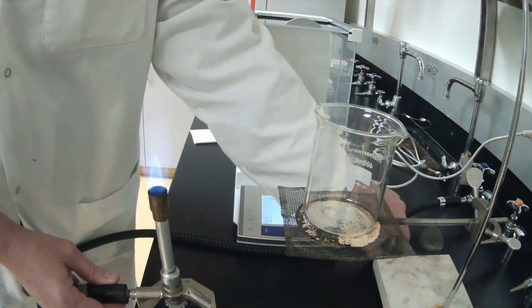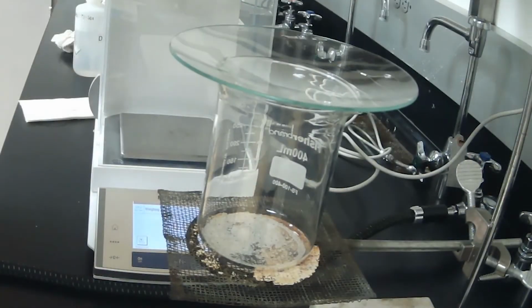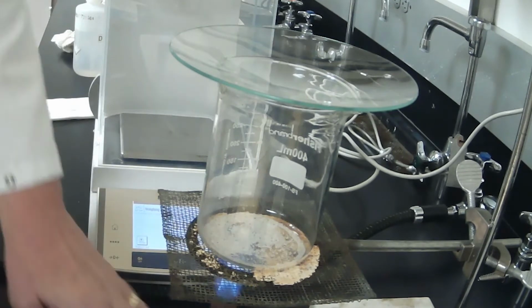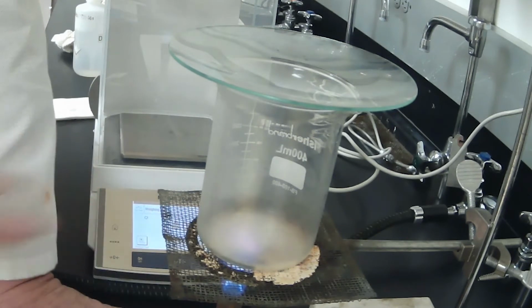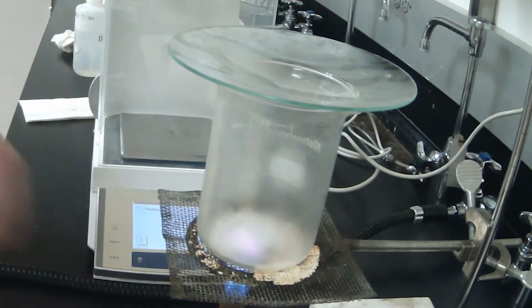And we're now going to put our beaker with our unknown mixture, which is already sitting on our ring stand. We're going to put a watch glass on top, just as a safety precaution, to try to capture as much of the ammonium chloride. Now, the tip of our Bunsen burner flame is just touching the bottom of the beaker, which is exactly where we want it.